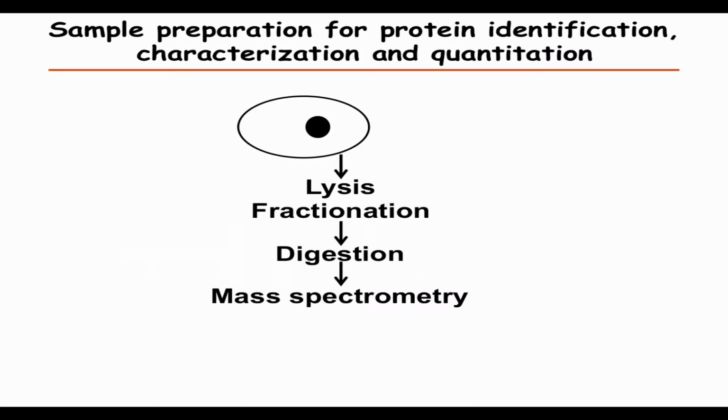So if we look at the steps to prepare a sample for mass spectrometry, we start out with the tissue or cell culture, and then first you have to lyse the cells and extract the proteins. And here there can be quite large losses. So if you start from a tumor tissue, for example, from a biobank, the yield of proteins could be as low as 1% or sometimes even less. But usually with cell culture we can get quite good yields.